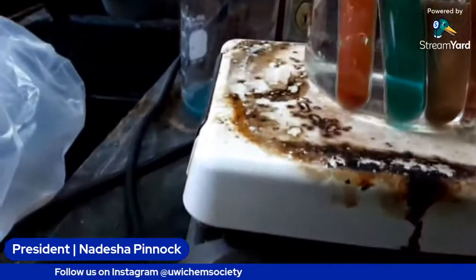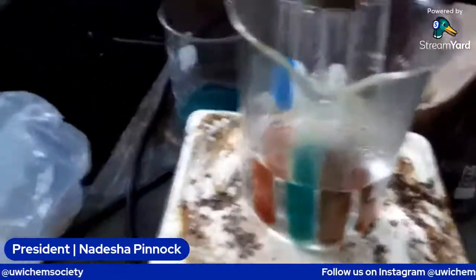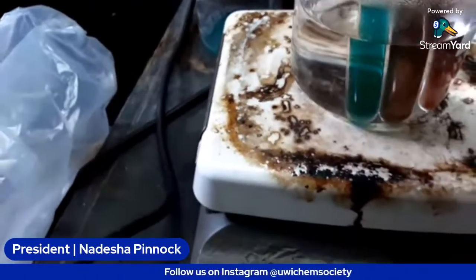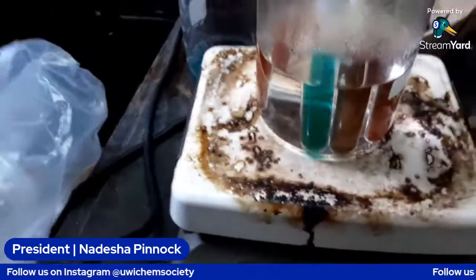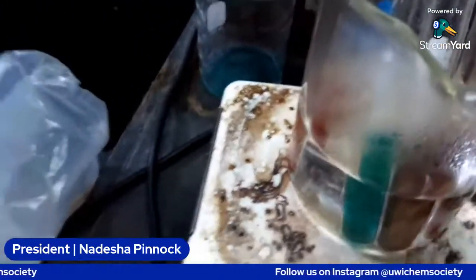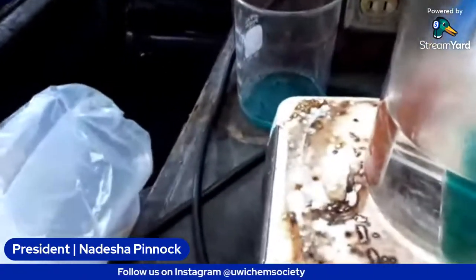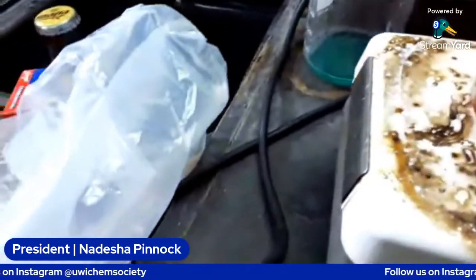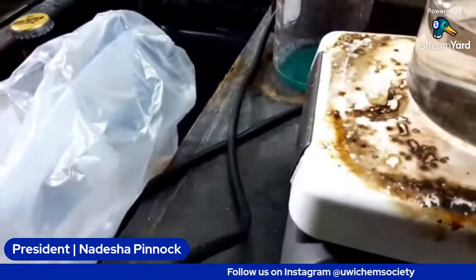So this is the progress of our Benedict test. Let me see which one is 1, 2, 3. Which one is this? Oh my God. Guys, guess what? The writing on the test tube boiled off.